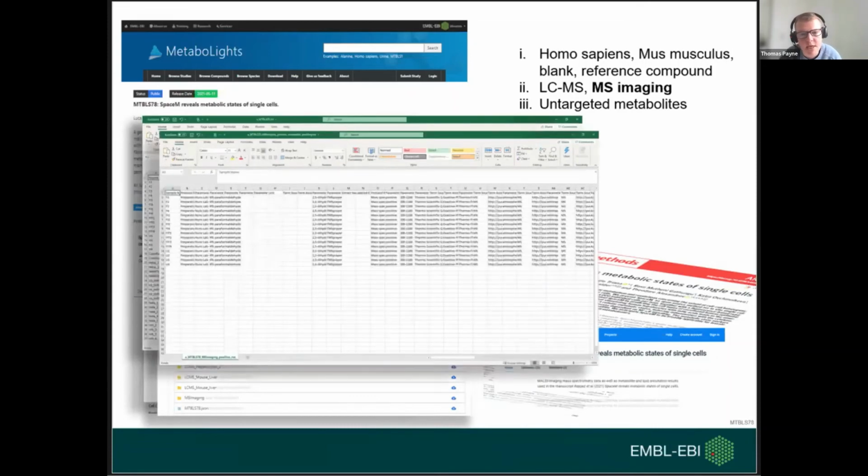From the assay sheet, again, if we open in Excel, we can see that it's a mass spec imaging assay. It has 16 rows, so that's the samples, and they all have identical experimental conditions. And as we move across, we will see each of these details.